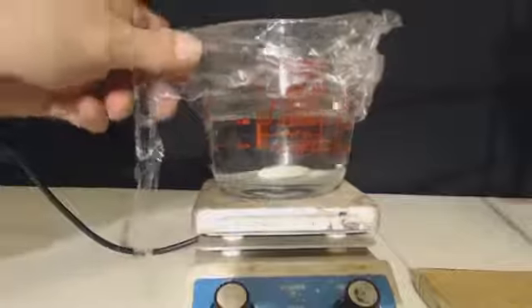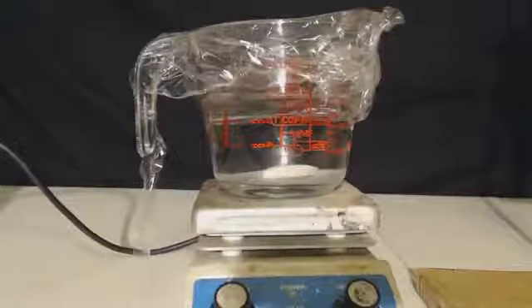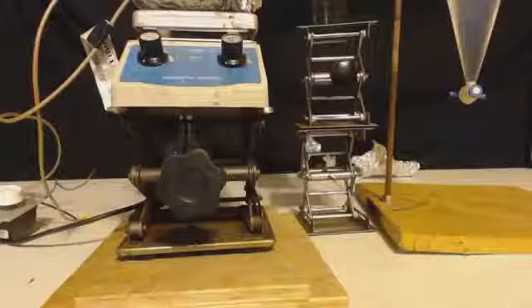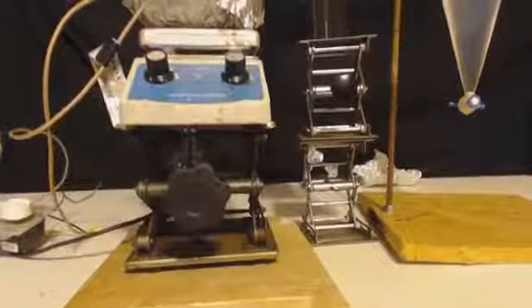So the first thing I'm going to want to do is get rid of all the low boiling things. Toluene boils at 110.8 or something like that. Let's just say 111. So I'm going to boil everything out of there lower than that.